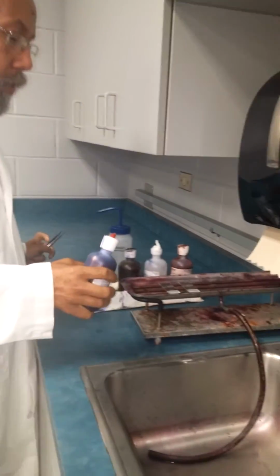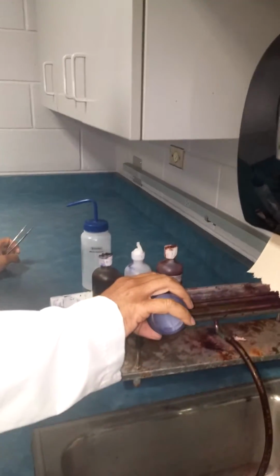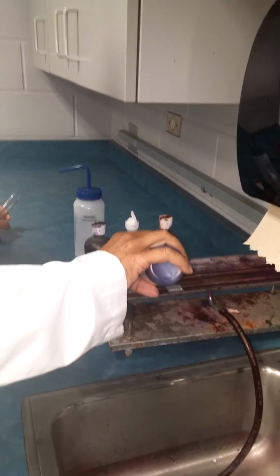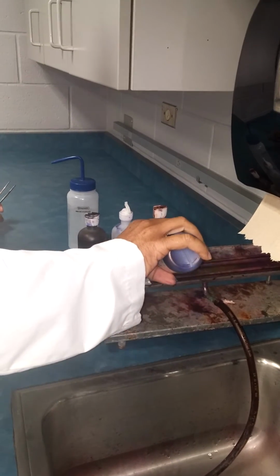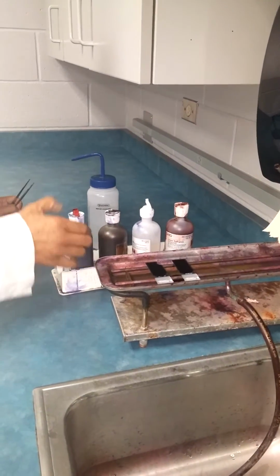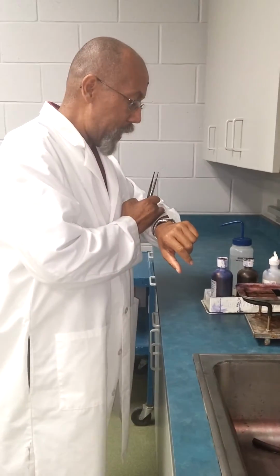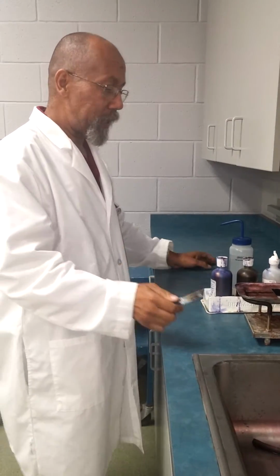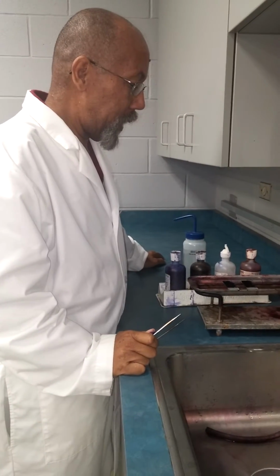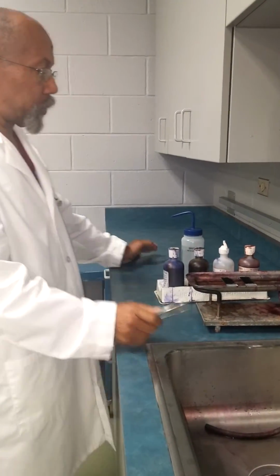Now I'm going to employ the primary dye, which is called crystal violet, and we apply that to the organism that's fixed onto the slide. Now the crystal violet dye is allowed to react with the organism for 20 seconds, and after 20 seconds we're going to rinse the primary dye, or the crystal violet, off.